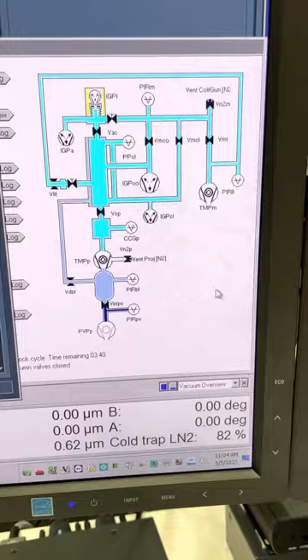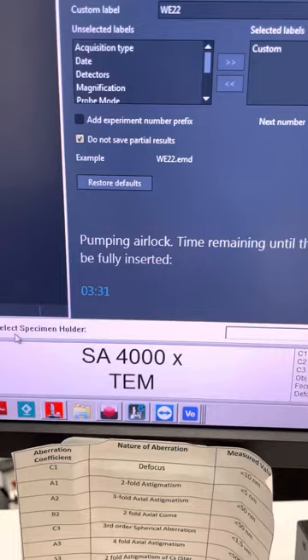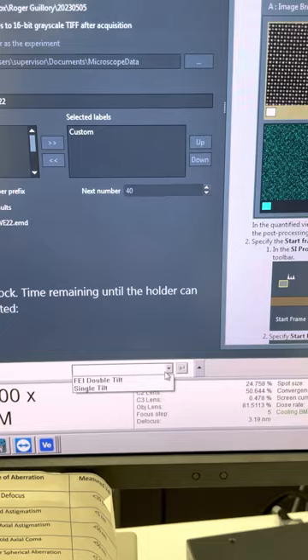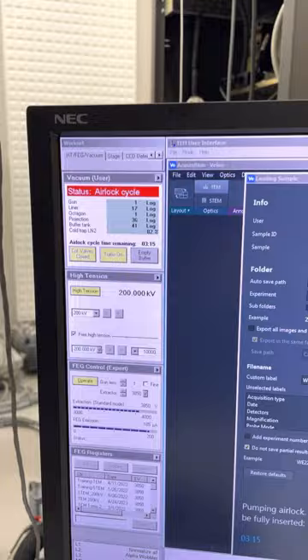You can also see here at the vacuum overview. Now you're gonna confirm the holder. Down here in the software, it says select specimen holder. Click this little arrow. This is the single tilt holder. Make sure you select the right holder and click this return key.